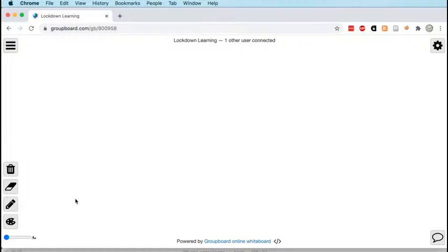The one which we're going to look at today, and the algorithmic approach which is used most frequently these days, uses a structure which is generated from your reads called a De Bruijn graph. I can't spell it. De Bruijn. That's it. I think it's got a J in it. Graph.